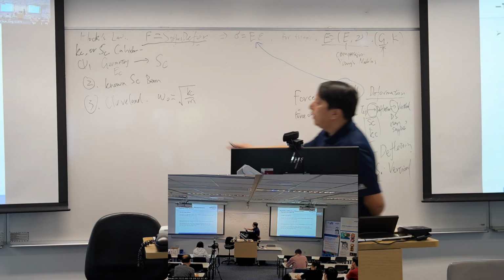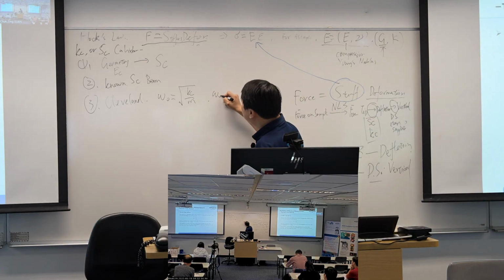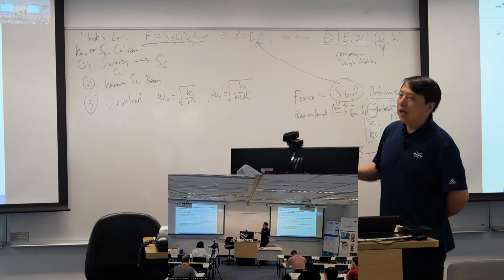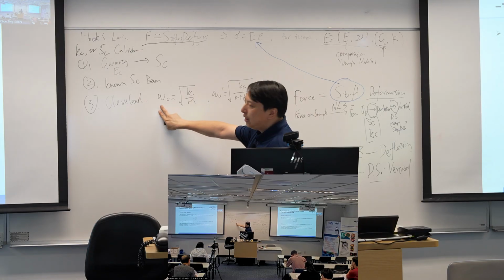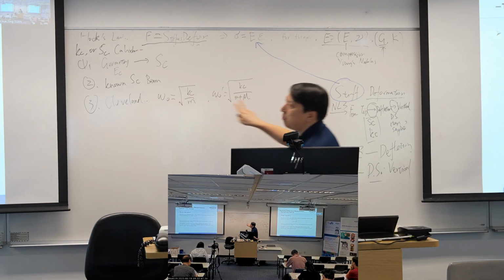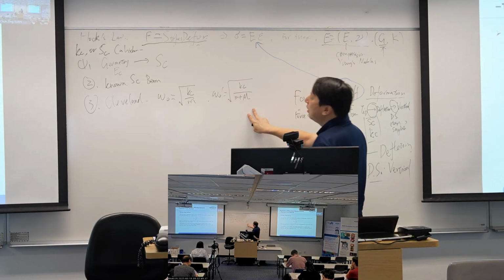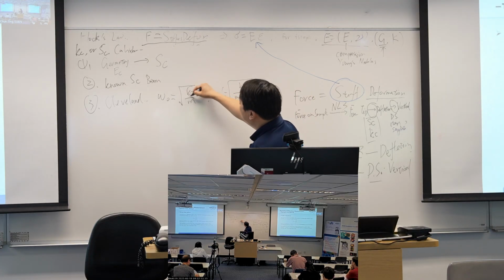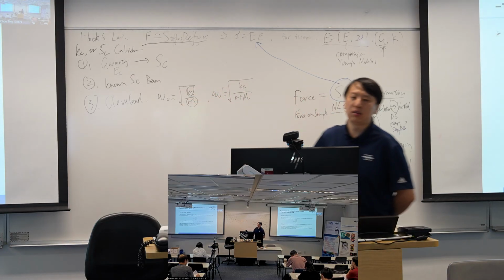And if we add another mass onto the cantilever, we can get the resonance frequencies before adding mass and after adding mass. When we measure the two frequencies, we can get Kc and the original mass out.